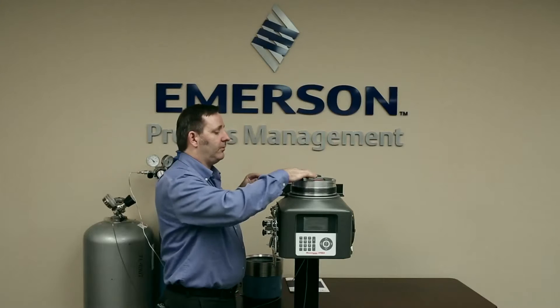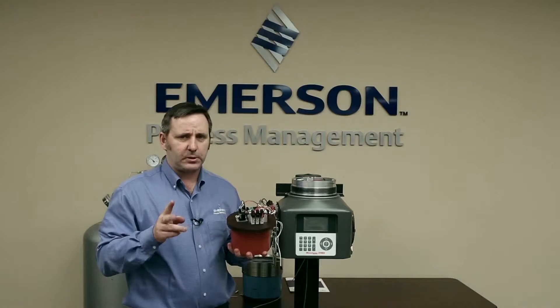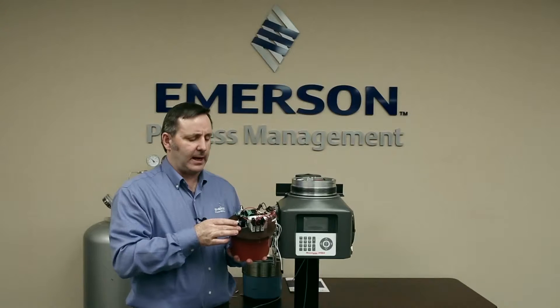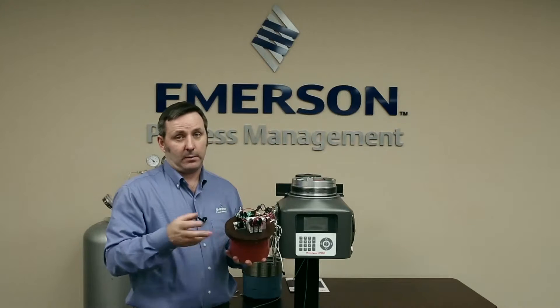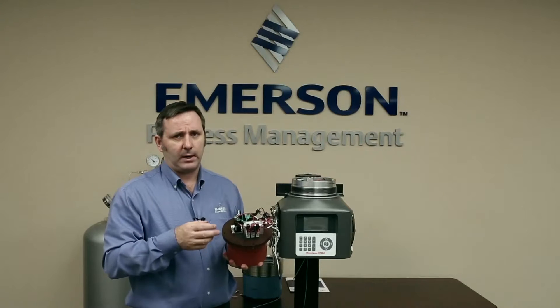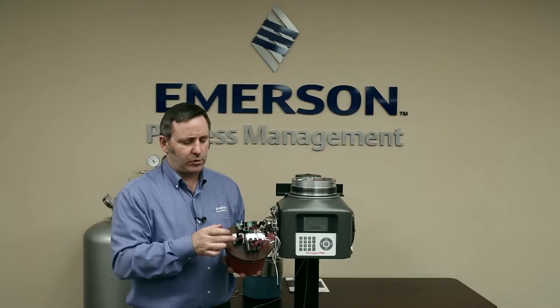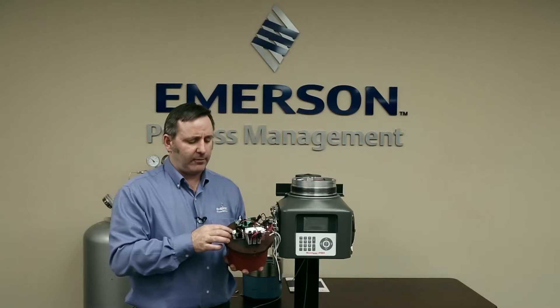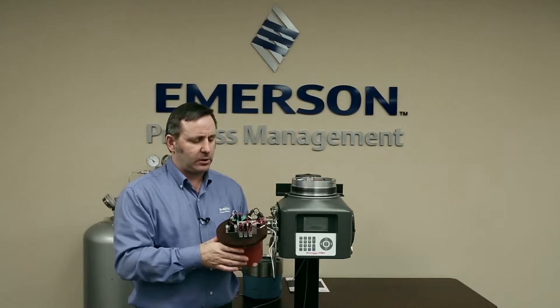So now we've taken all the O-rings off and we're ready to put on the new module. You want to make sure — we have two options on the 370: we have a one-stream in CAL or a multi-stream in CAL. Make sure that if you're replacing a multi-stream module, you replace it with a multi-stream new module. To tell the difference, look at the stream selection solenoids — a one-stream in CAL has two solenoids, while a multi-stream module has three stream solenoids and one calibration solenoid, four solenoids in total.